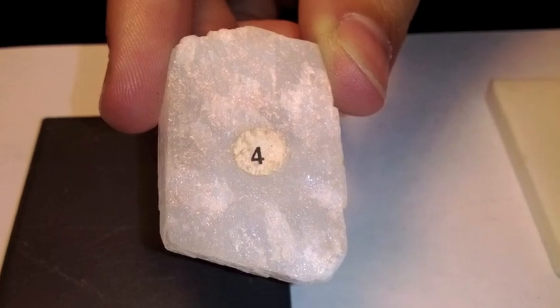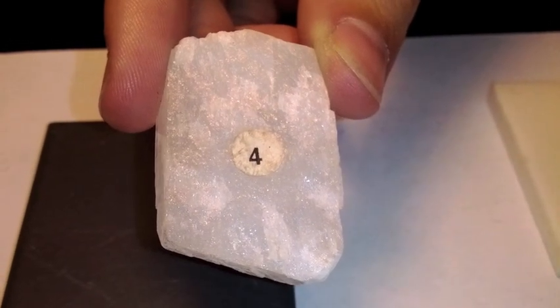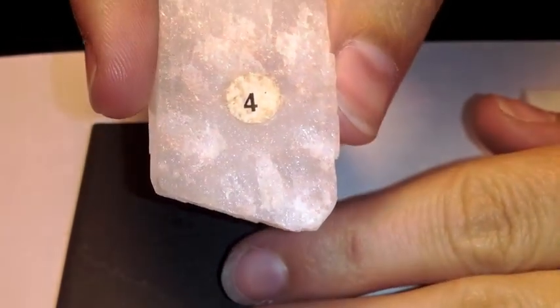This mineral is number four, it is Calcite. Look at the color of the mineral. What color streak do you think we're going to get? Let's check it out. Very definitely a white streak.